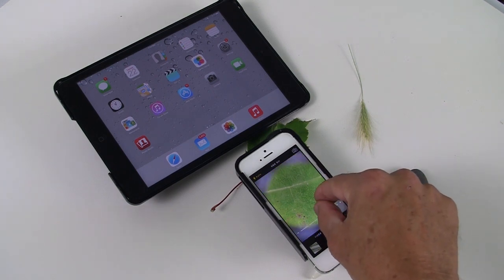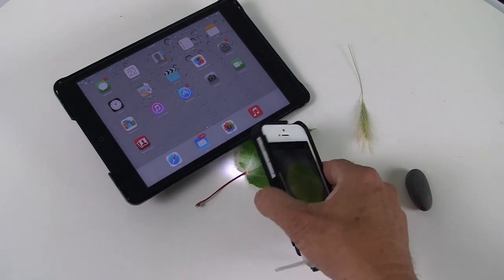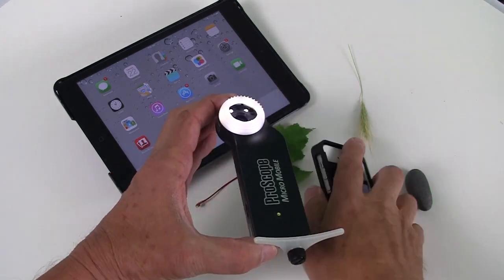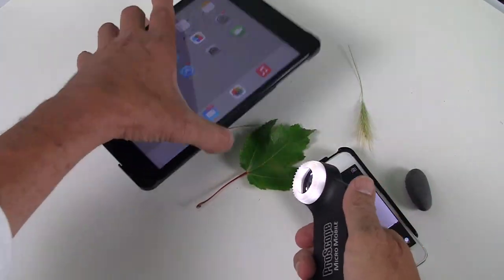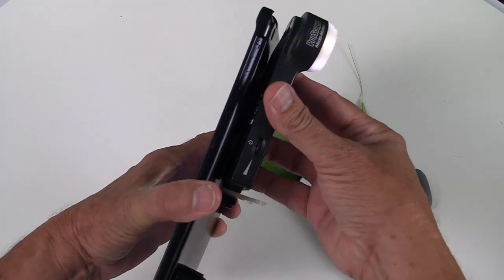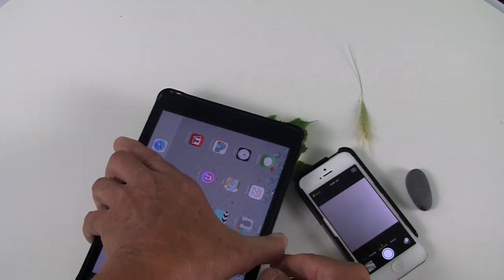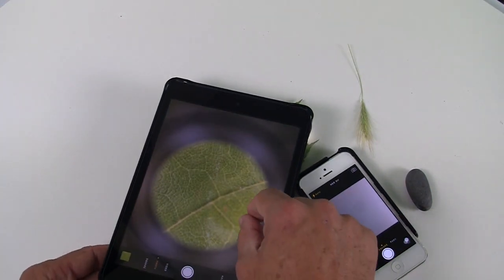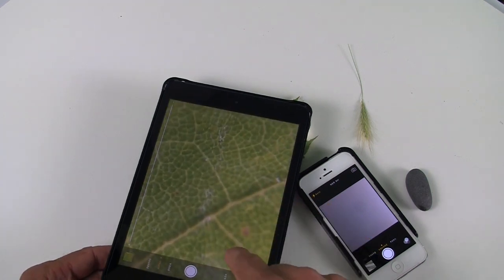Many people have a second mobile device, but you don't need to re-buy the kit. All you have to do is remove the ProScope Micromobile base and buy an additional sleeve for that device for only $20 more. Mount the ProScope Micromobile base on that, and again I'm just using the camera app here. And I'm set.